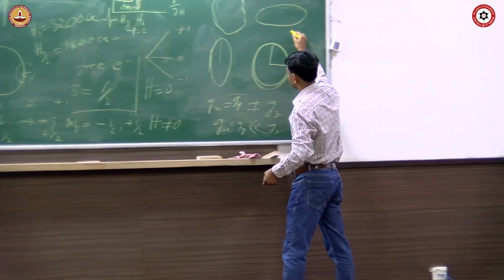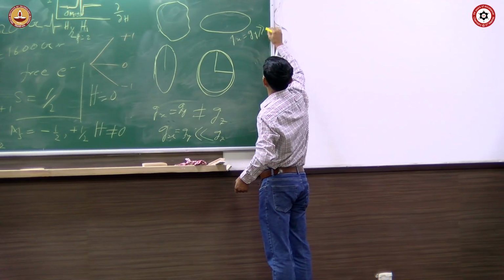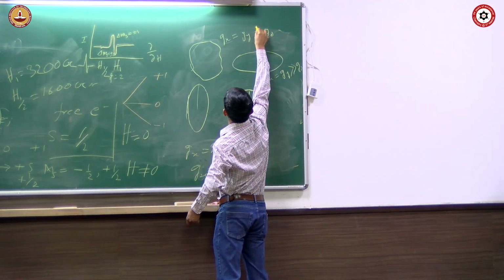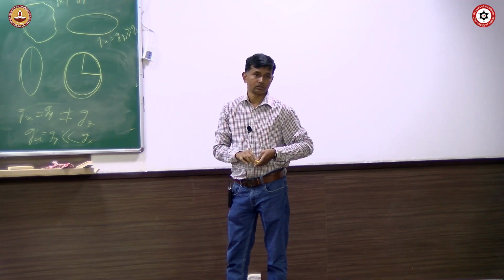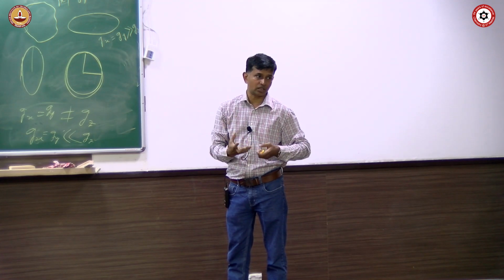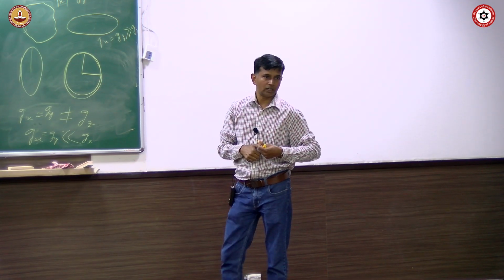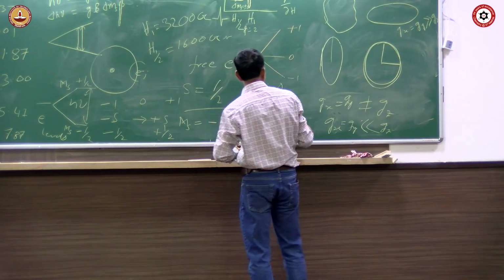Here gx and gy may be the same or greater than gz, and this is the case where gx, gy and gz are all different from each other. This you can see in EPR spectroscopy. So whether a compound's electron spin density distribution is symmetrical or unsymmetrical, you can probe by EPR spectroscopy. I think this is a very crucial parameter. And why is it important?